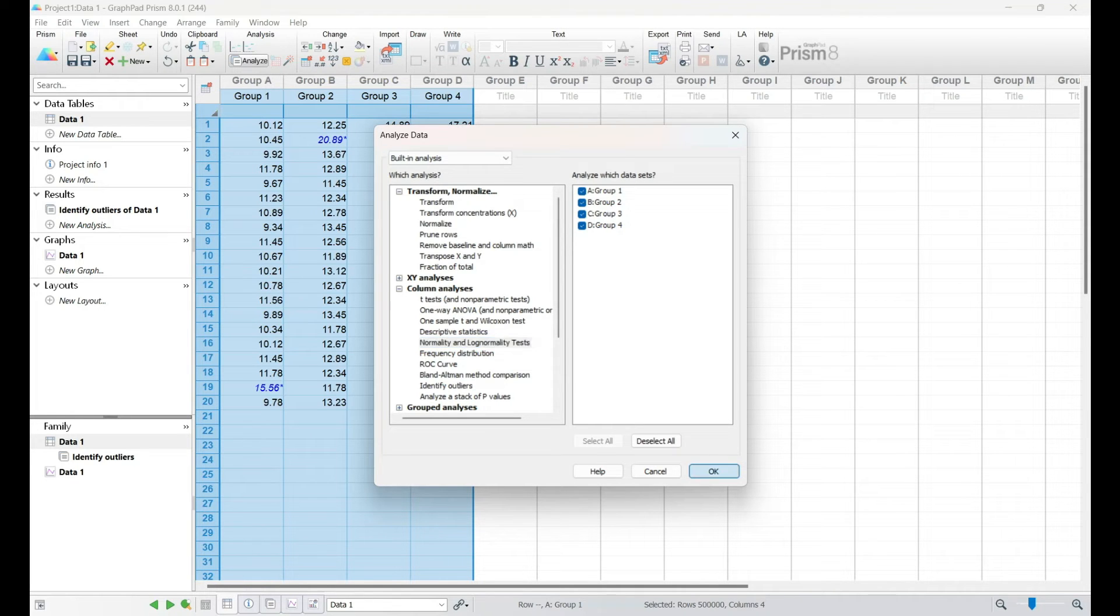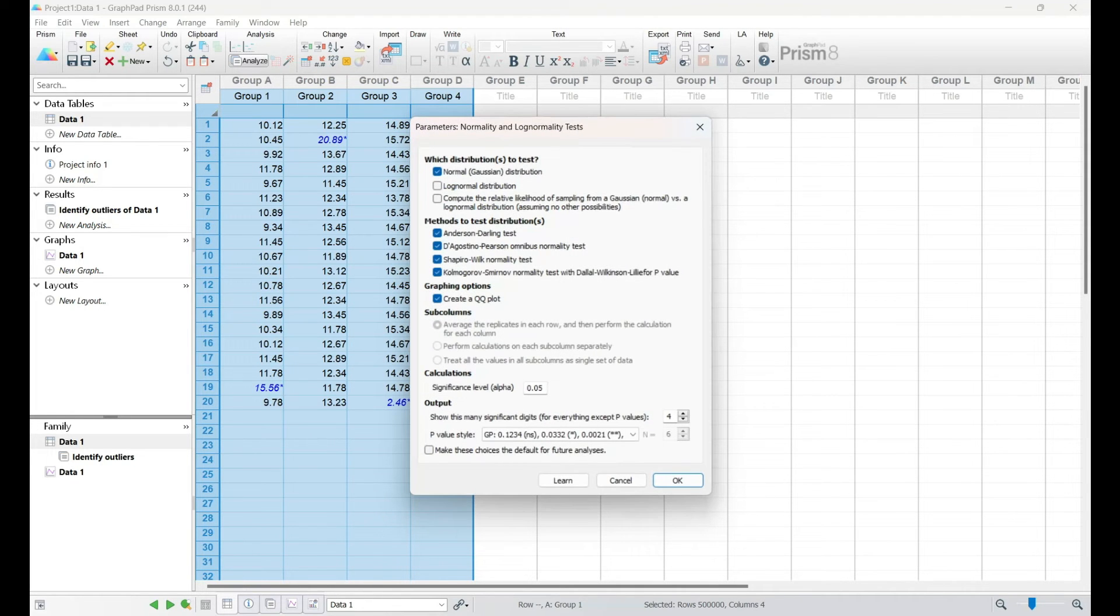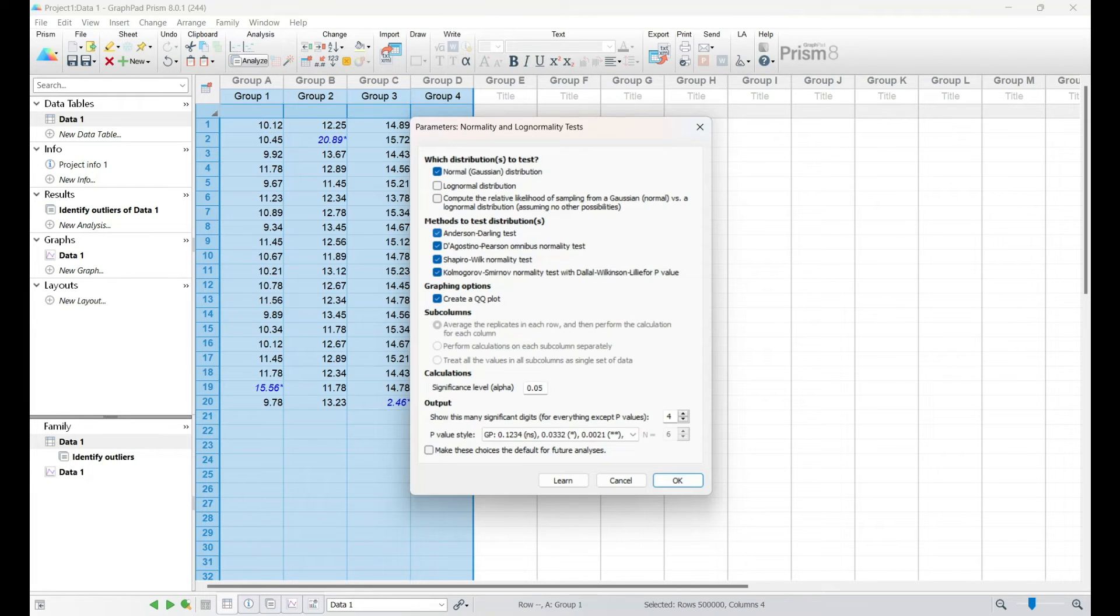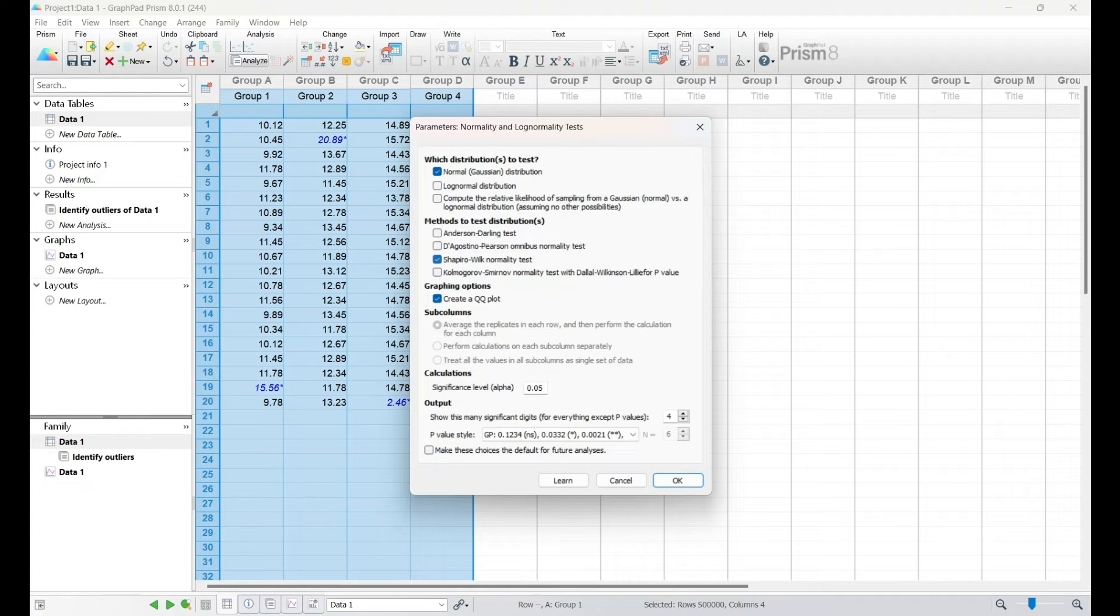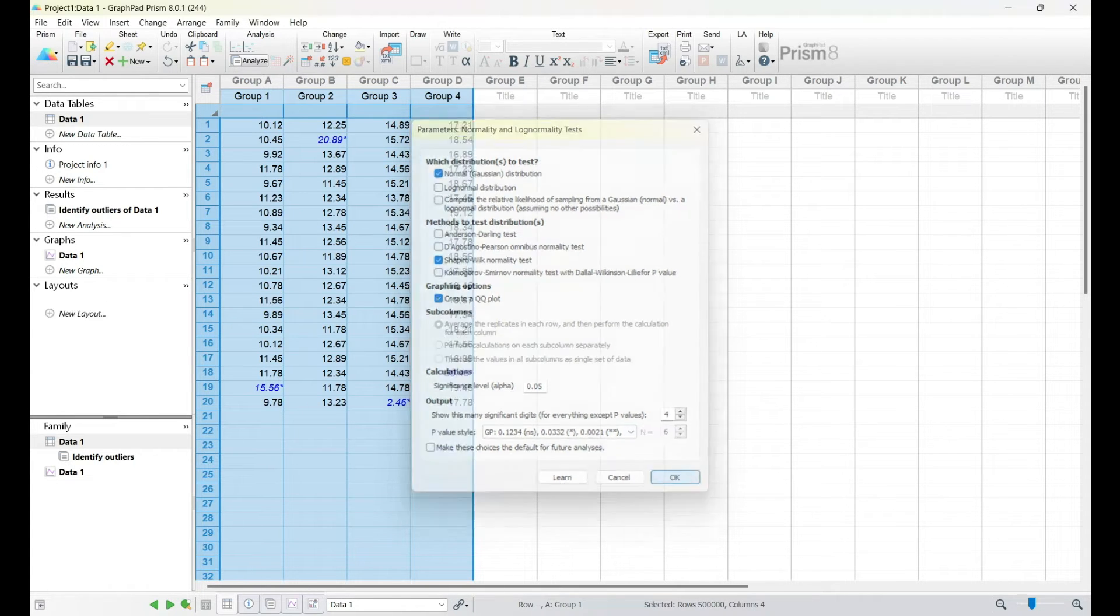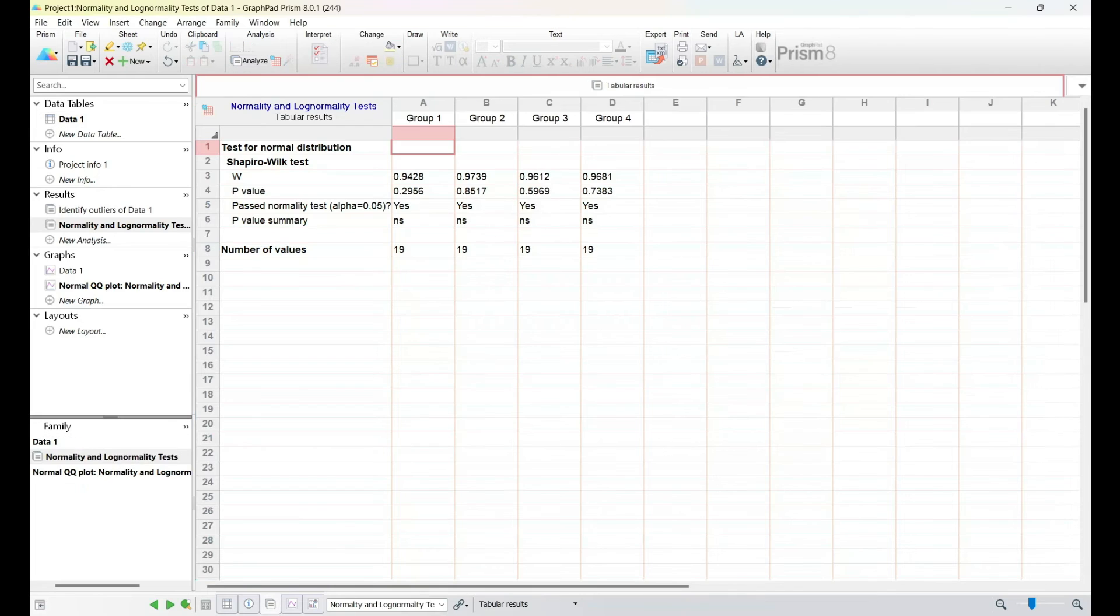I'll guide you through the interpretation of normality plots and test results, emphasizing the importance of meeting the assumption of normality for certain statistical tests. Understanding the distribution of your data lays the foundation for selecting the appropriate statistical test in the next section.